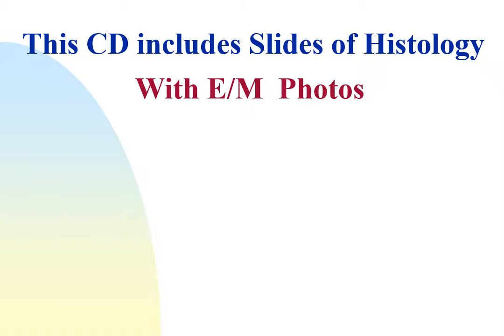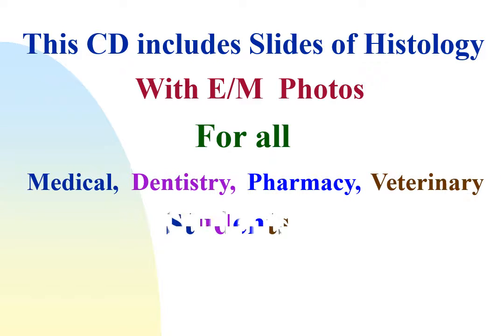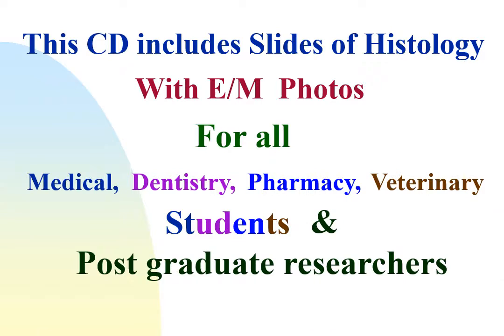This CD includes full explanation of different practical slides of histology and some electron micrograph photos for all medical, dentistry, pharmacy, veterinary students and postgraduate researchers.